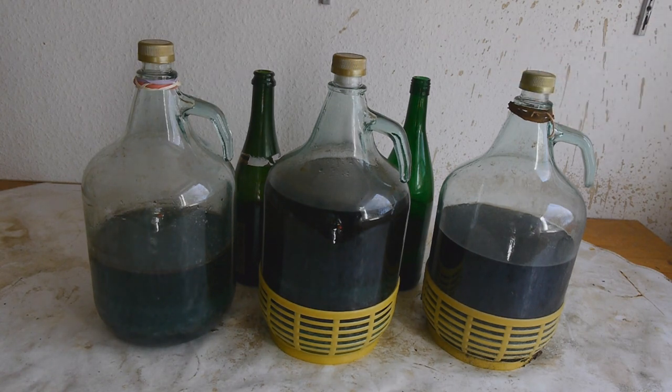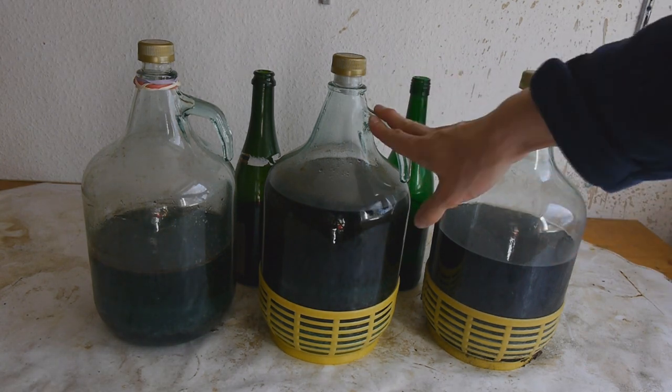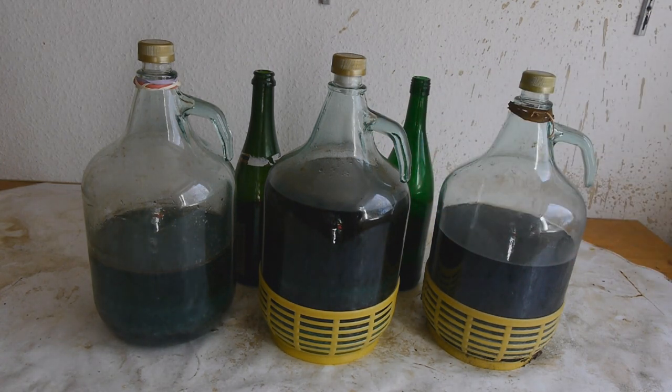And the easiest way to deal with this is to turn it all into iron oxide, which is more useful because you can use it for stuff like thermite, and it's also a lot safer because it isn't as easily soluble in water and it's easier to extract. So today I'm going to show you my process for turning huge amounts of iron sulfate into iron oxide. That way I don't have to throw all this away and I actually get something quite useful out of it.